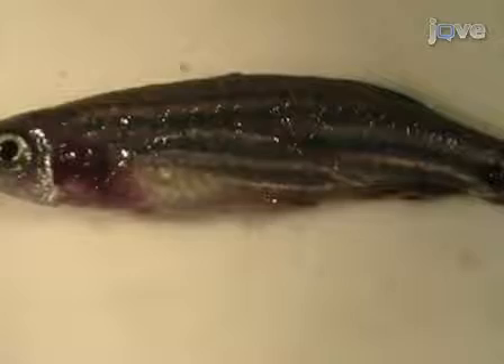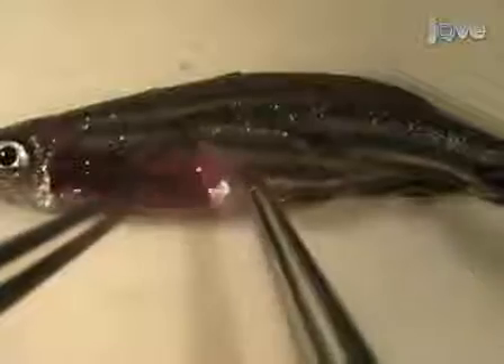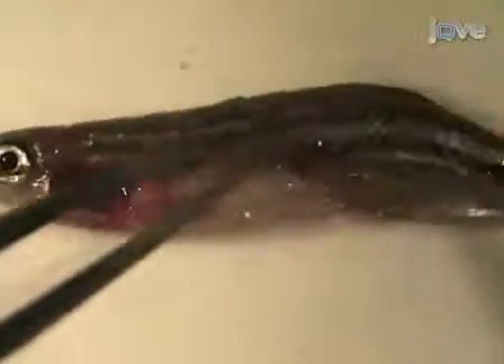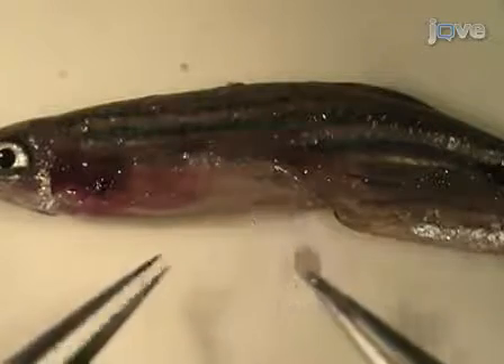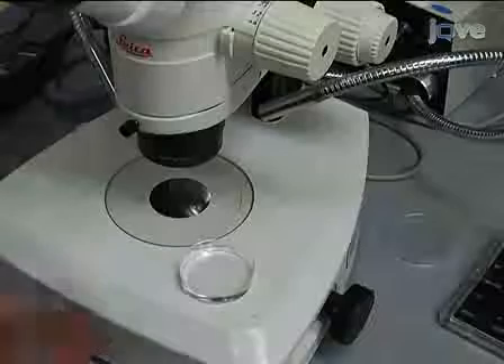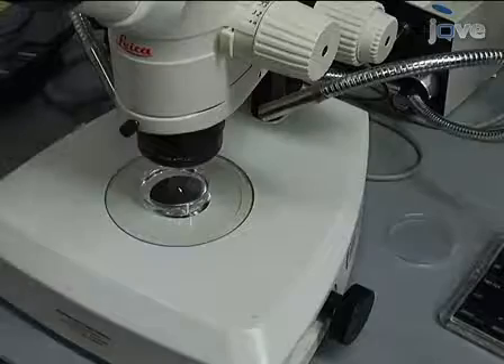Carefully remove the skin and underlying muscle from the side of the fish to expose the internal organs. The testes are long, white, paired organs that are attached to the dorsal body wall. Remove the testes and place them in a dish of room temperature PBS. Remove the fat associated with the testes and examine them with reflected light under a dissecting microscope to visualize the seminiferous tubules, which contain cysts with various stages of developing germ cells from spermatogonia to spermatids.